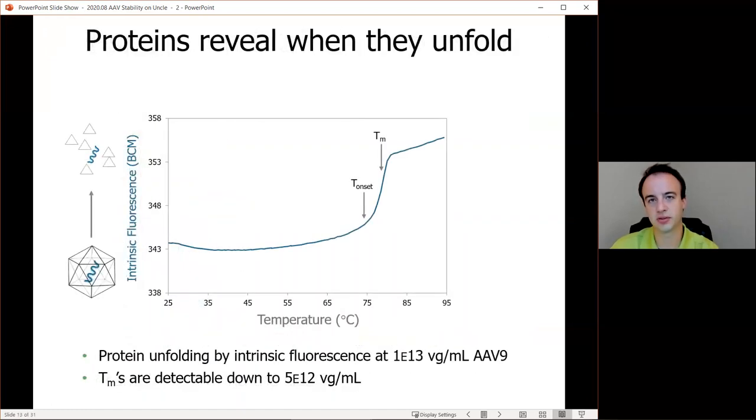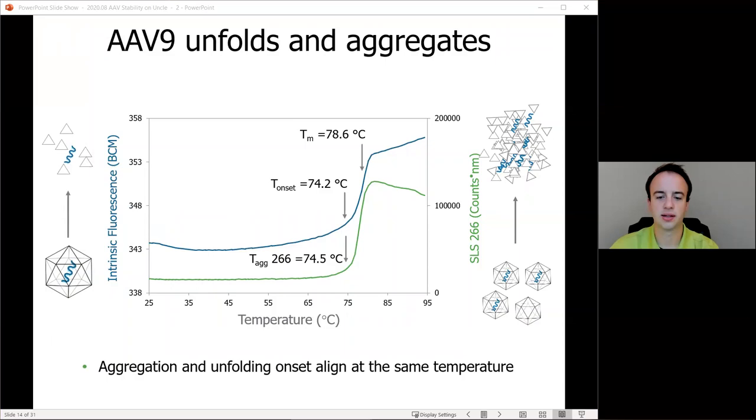But if we analyze that intrinsic fluorescence peak for the spectral center of mass, also known as the barycentric mean or BCM wavelength, we'll see that that spectral center of mass also shifts upward to higher numerical values of wavelengths in that redshift moment. So in this case, we can identify that by looking at the inflection points in that BCM curve. So we see a BCM inflection point at 78 degrees Celsius. So that's why we labeled our Tm, or our melting temperature, for this experiment. The T onset is when that slope starts to increase. So that's when the proteins of the capsid are unfolding. If we overlay that data with SLS data in green from the 266 laser, we can see that aggregation behavior and unfolding onset line up at the same temperature, about 74 and a half degrees Celsius.